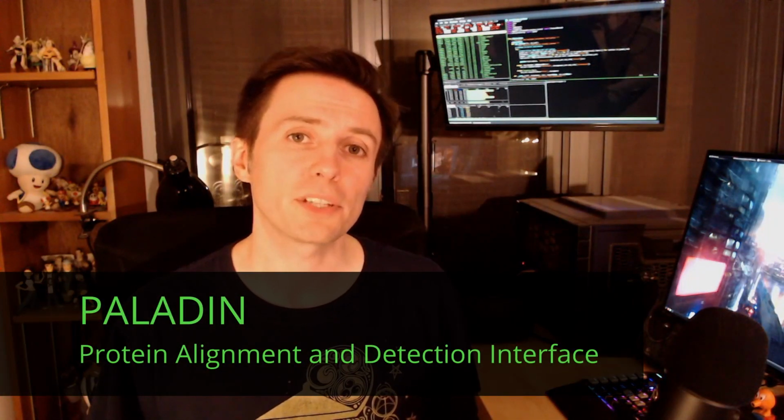I wanted to start out with a bioinformatics topic, because I remember when I first got into the field, I was very overwhelmed by the amount of software out there. I had so many questions about what I should run, how it worked, all the command line options. It was very overwhelming. Today, I'd like to talk about using Paladin to characterize your metagenomic sequence data.